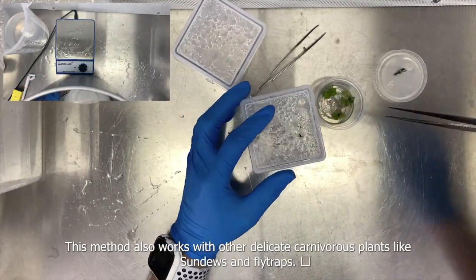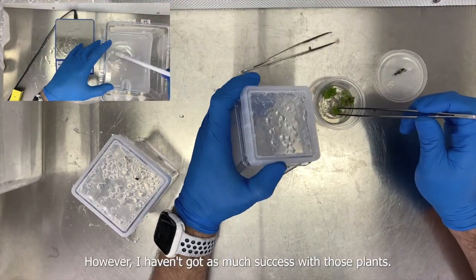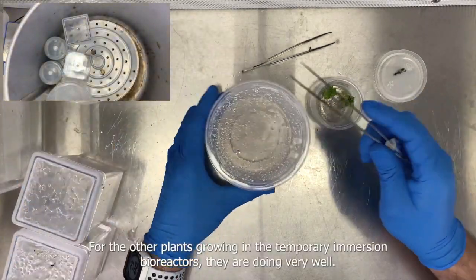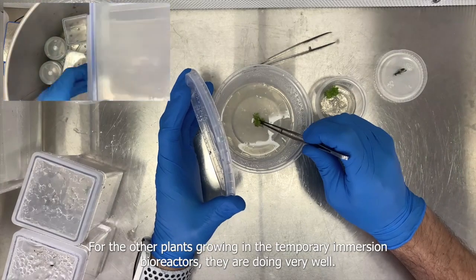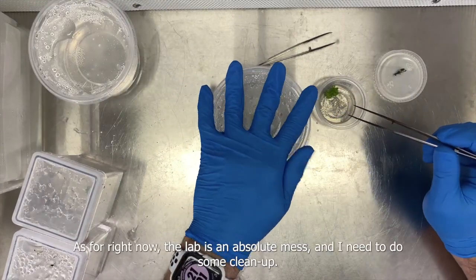This method also works with other delicate carnivorous plants like sundews or flytraps, though I haven't had as much success with those plants yet and will do more experiments in the future. As for the other plants growing in the temporary immersion bioreactors, they are doing very well and I will make a video update next week.